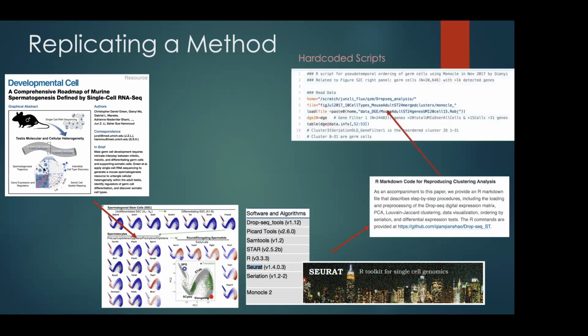The reason is that when they're writing their code, they are not that thoughtful about other people running it in the future. For example, they put their own folders into their code that they ran in their own environment. These are not going to work for me. If you're not a programmer, and you just want to run their code, it's impossible.